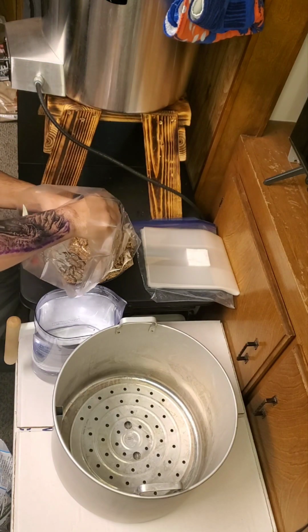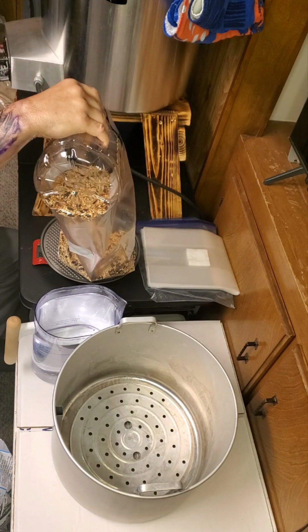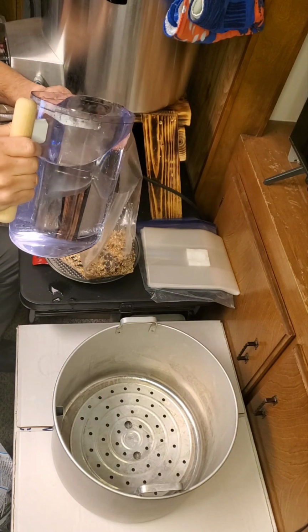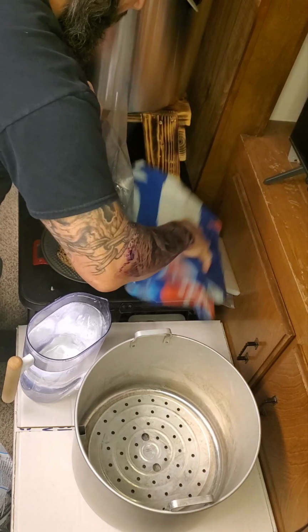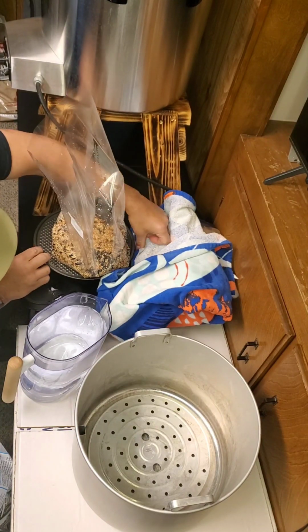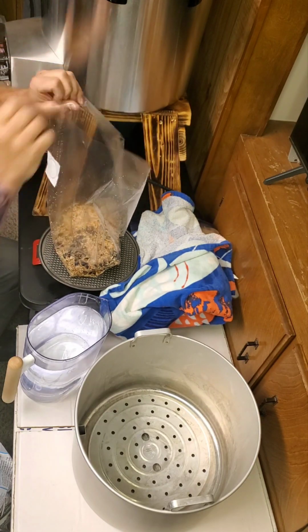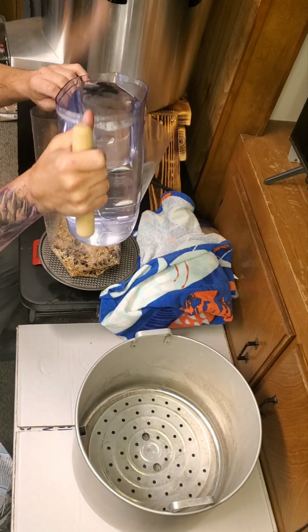Yeah, it easily fits 1,000 grams in here. But it's okay if you end up taking 2 scoops. The jug's a little over full there, which is why I have a towel. Started spilling off. Don't want to spill too much. We're off my weight there. And generally to not spill, I just kind of curl it and pour it towards my fingers. But you got to watch your weight when you do that. It's so funny, over full.